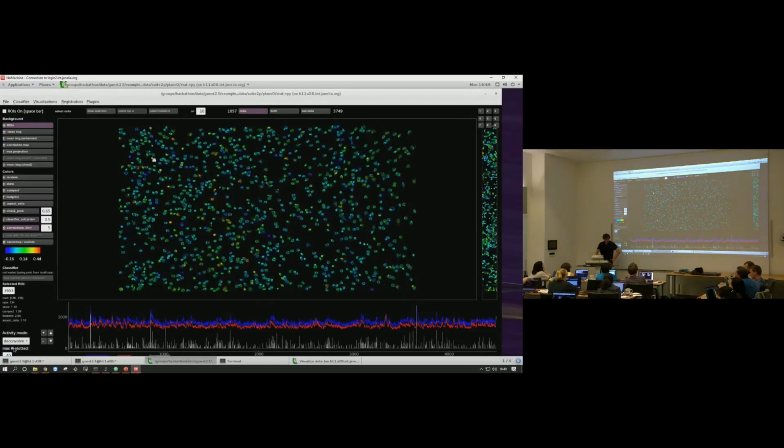And we haven't talked about deconvolution because you guys had enough on your minds already. But I'm just going to briefly introduce it now, and again, we can talk a lot more maybe tomorrow about it. The deconvolved trace is what you see at the bottom here as this kind of much sharper trace that's mostly 0 most of the time, and then it's some positive number otherwise. And that's an algorithm we run on the neuropil subtracted trace, so not quite the blue. So the blue minus the red, that's our estimate of the fluorescence from this cell.